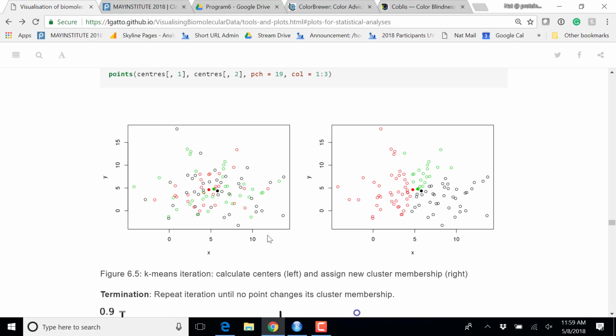So there is one argument to the k-means, that is the number of iterations that need to be repeated, or the maximum number of iterations, and that's generally high enough for the algorithm to converge. But there is another parameter that influences the result, which is the kind of initialization step.